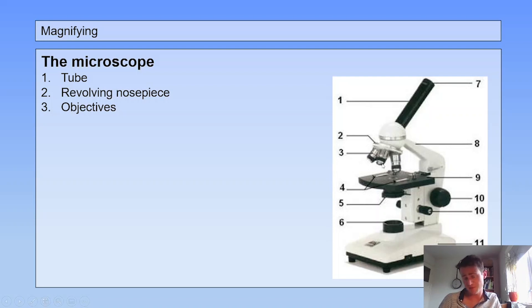You see the objectives here, and within these objectives there are tiny little magnifying glasses. So by changing the objectives you can change the magnification.